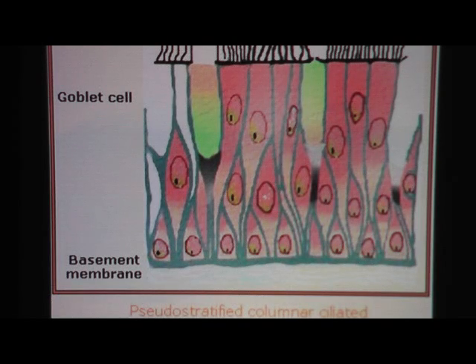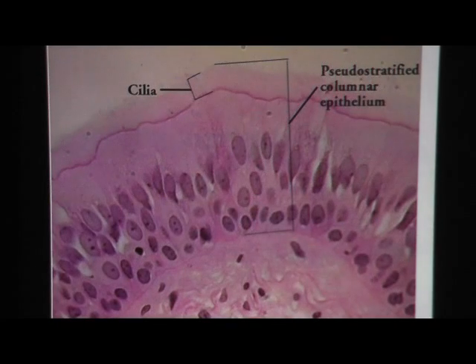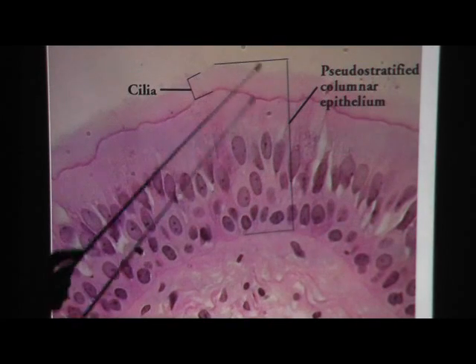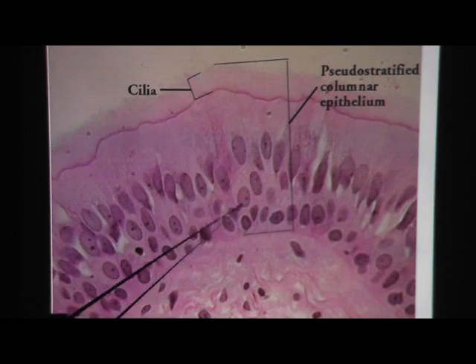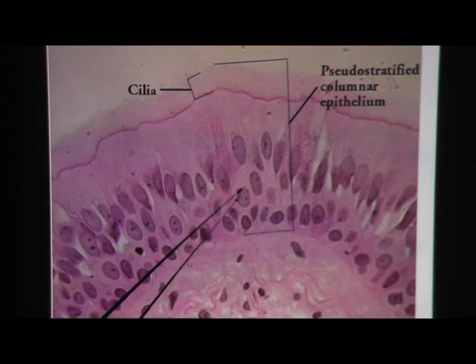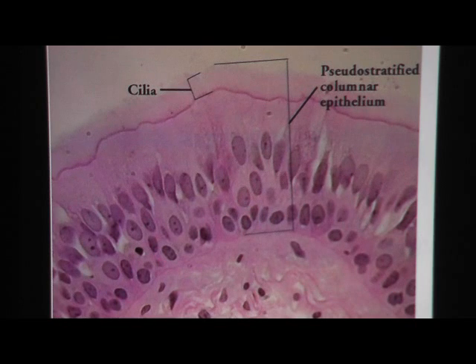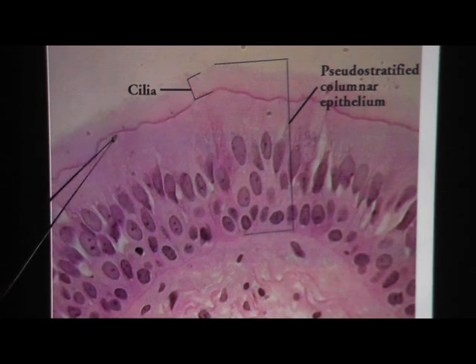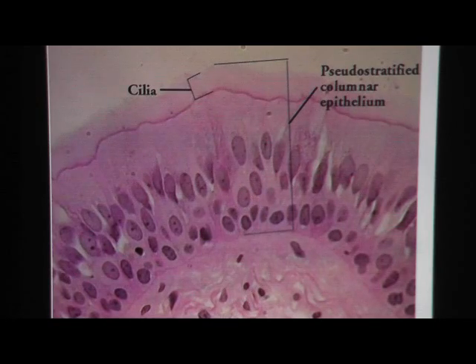It looks like many layers, but it's only one. And up here we have cilia. Here's an example magnified 400 times. These are nuclei of tall columnar cells — it gives the impression of many layers, but it's only one, so that's pseudo-stratified columnar epithelium. The thick material at the top is cilia, so altogether you say: ciliated pseudo-stratified columnar epithelium.